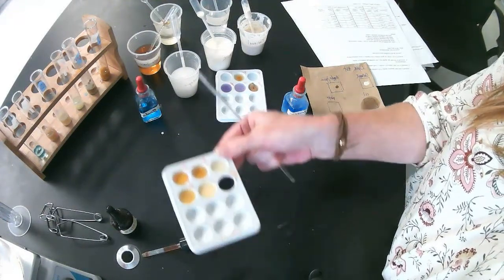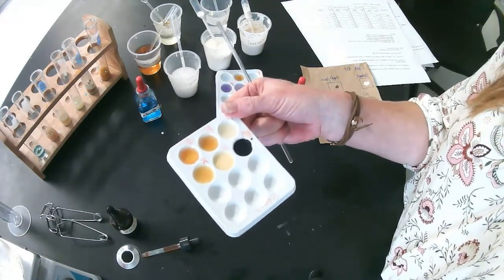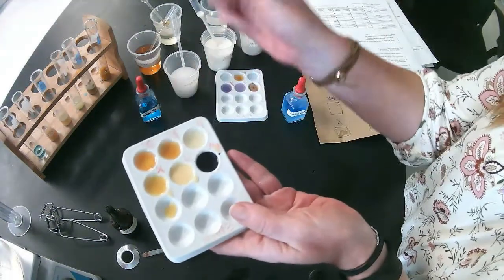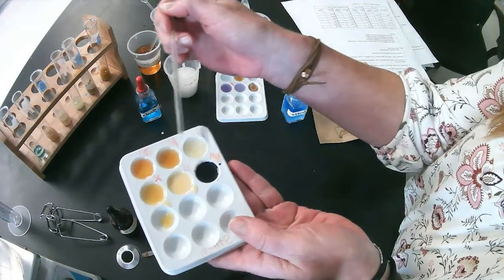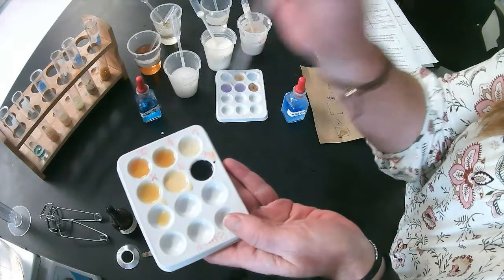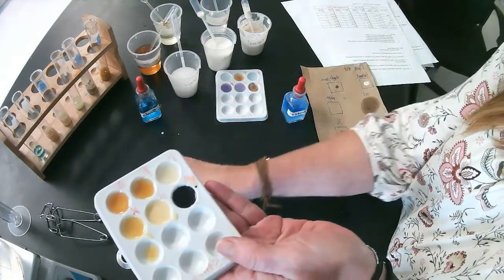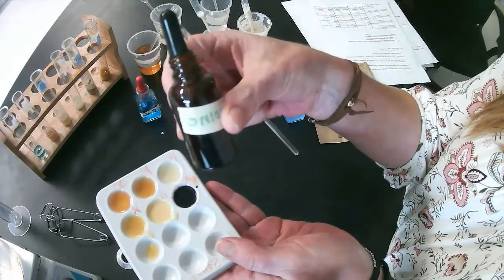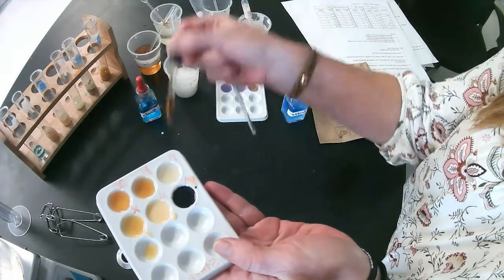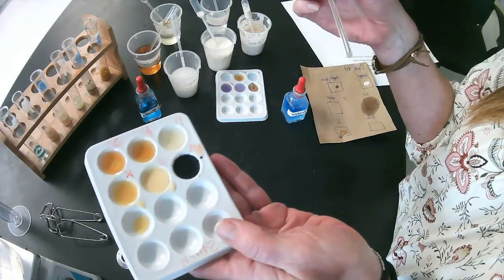The last one is the iodine, testing for the other kind of carbohydrates, which are starches, which are big sugars. So again, I had in the well plate water, apple juice, oil, oatmeal, milk, and the X factor or X substance. And then we added 10 drops of iodine. And iodine again is orange, right? And if it interacts with starch, iodine turns black.